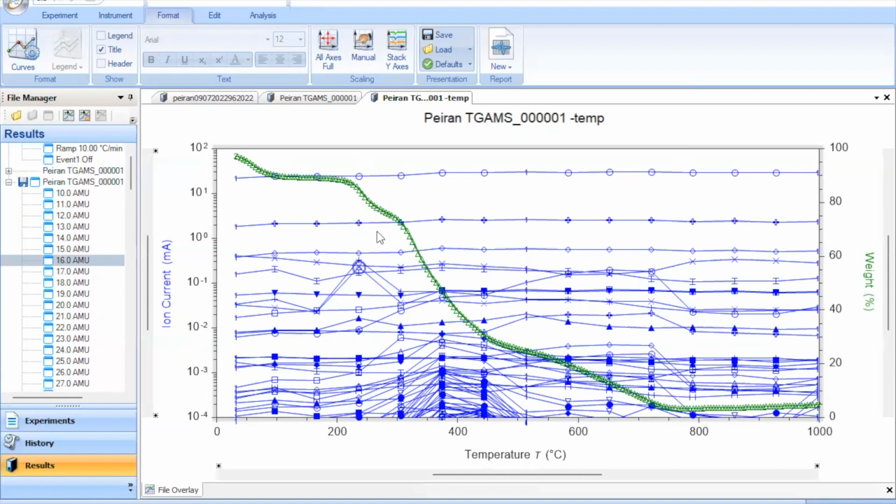The second peak should have carbon dioxide and carbon monoxide. Unfortunately, with carbon monoxide, since it's carbon and an oxygen atom, it's going to have an AMU of 28. But our feed gas was nitrogen, and nitrogen, which is diatomic, so 2 nitrogens, has an AMU also at 28. So we're not going to see much change for carbon monoxide.